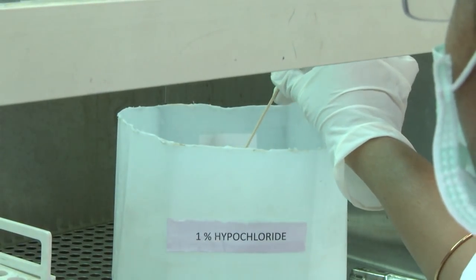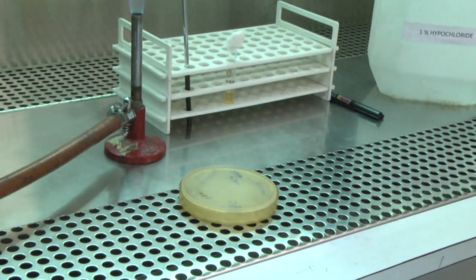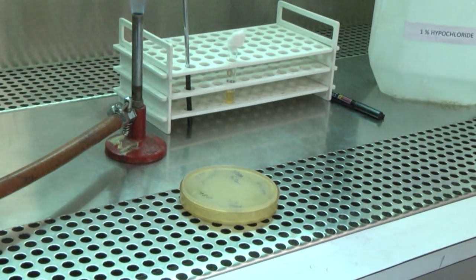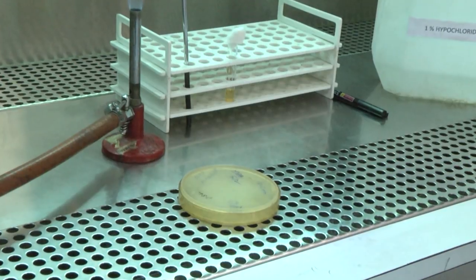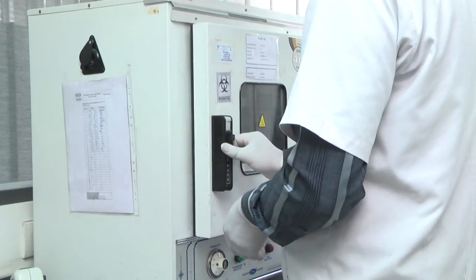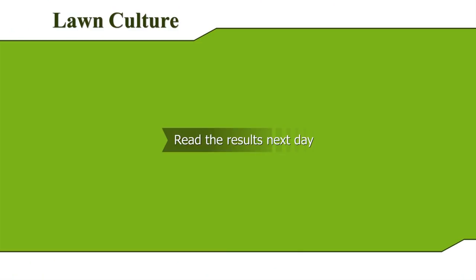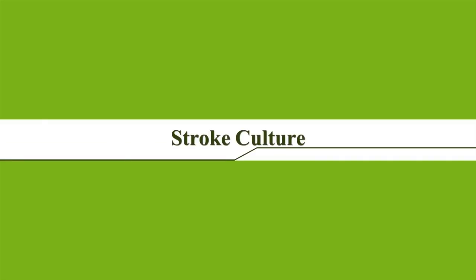Discard the swab in a disinfectant solution. Allow the plate to dry for a few minutes with the lid closed at room temperature. The antibiotic discs can now be placed on the inoculated plate using sterile forceps, sterile needle tip, or an antibiotic disc dispenser. Incubate the plate overnight at 35 to 37 degrees centigrade and read the results the next day.